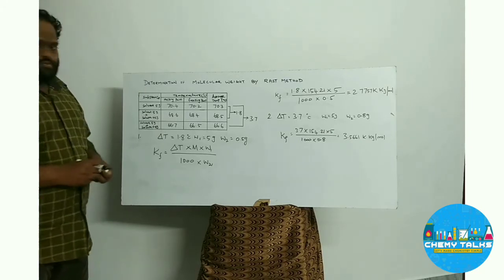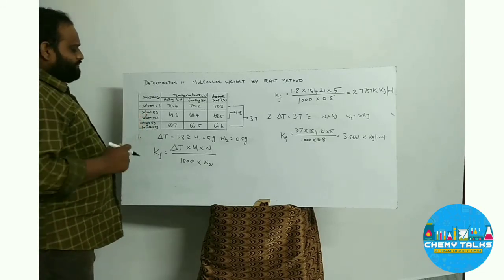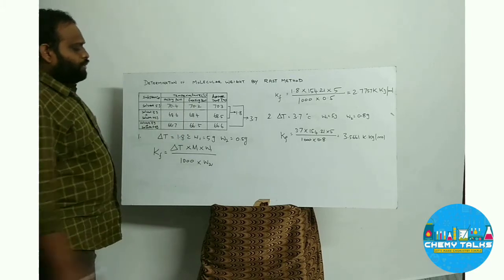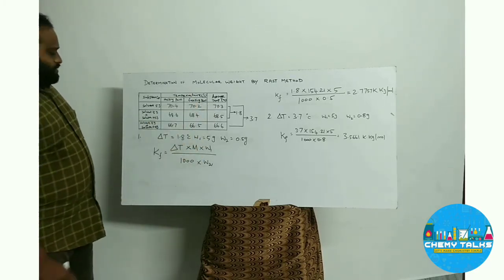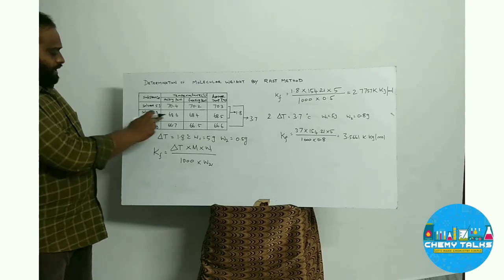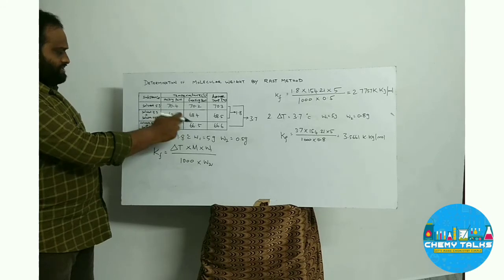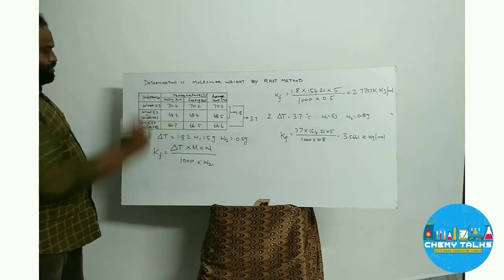From the experiment, we get the result that for the pure solvent, the melting point is 70.4 and the freezing point is 70.2. We get the average 70.3. After adding solute to the solvent, there is a difference in the freezing point. The freezing point is lower when compared to the pure solvent.